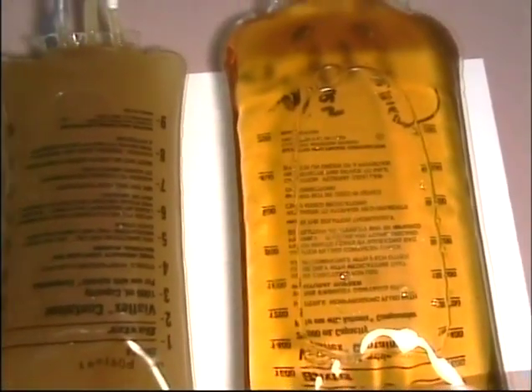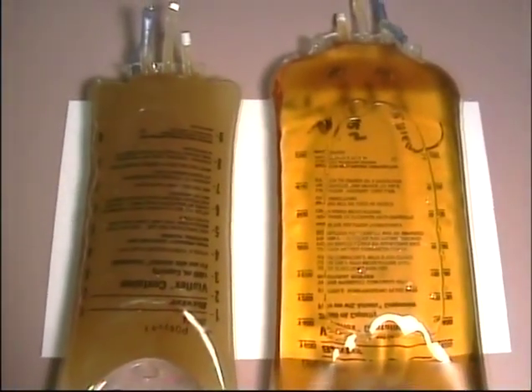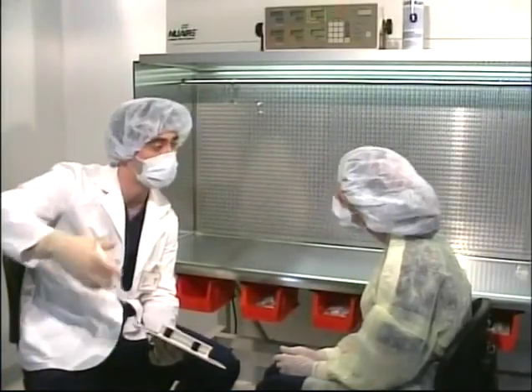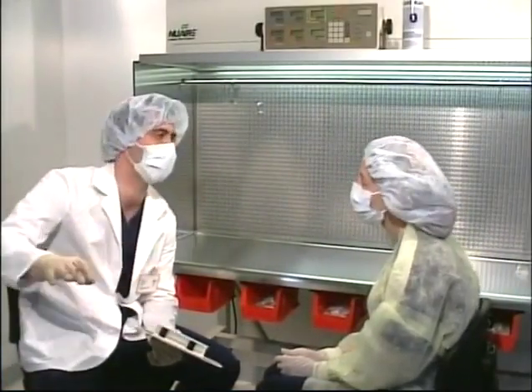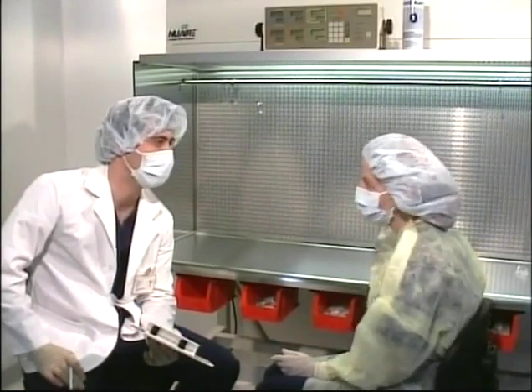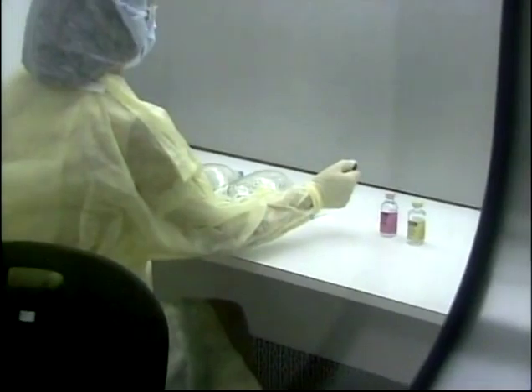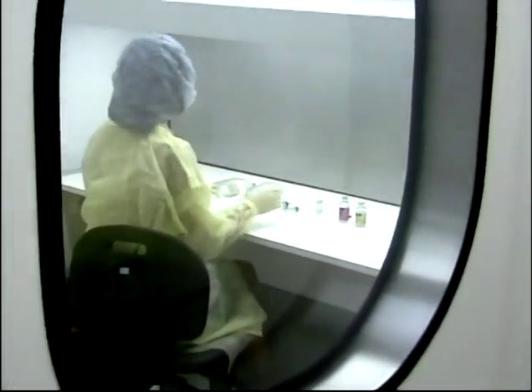If any of the products become turbid, this will indicate that you have introduced viable contamination into the product at some point during the simulated process. You will need to repeat the exercise following the necessary retraining. From time to time, you will be asked to repeat this exercise for revalidation based upon the requirements of your institutional policies.